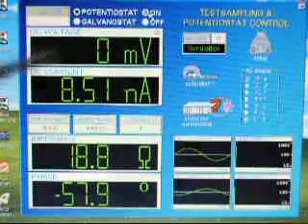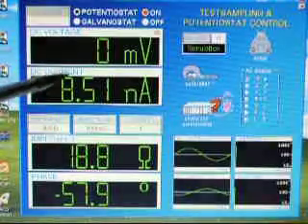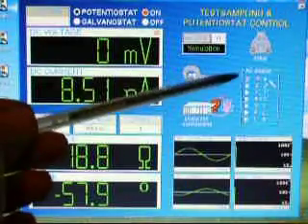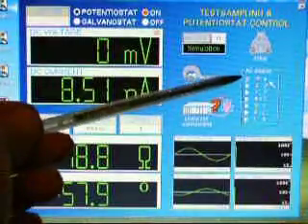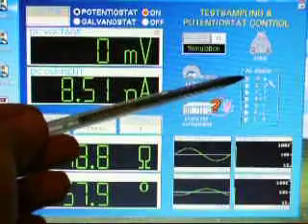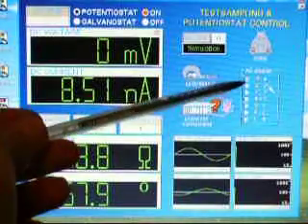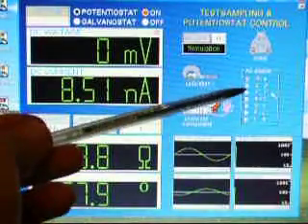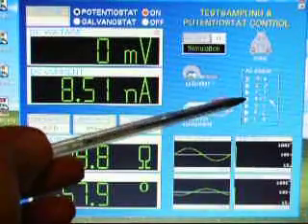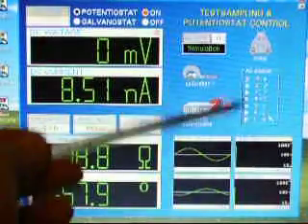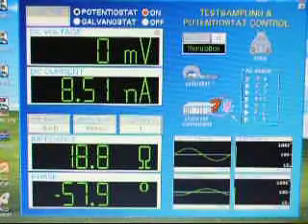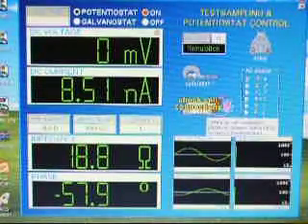We can turn our potentiostat on and then choose a display: either impedance magnitude and phase, real and imaginary impedance, admittance, and we also have RLC values in Q as well.